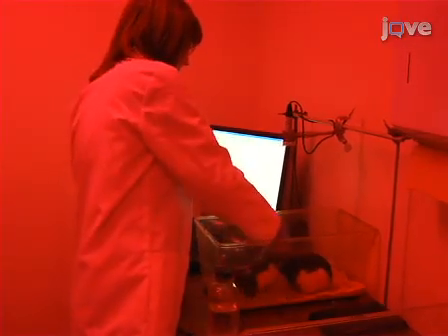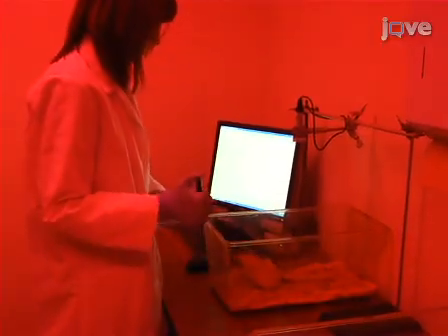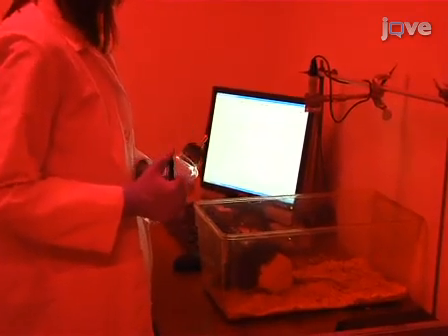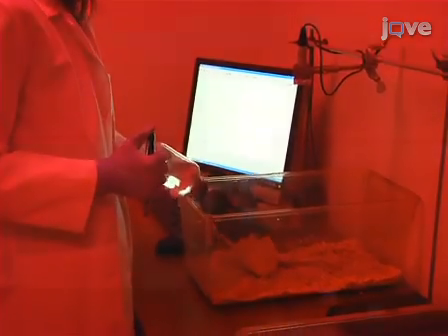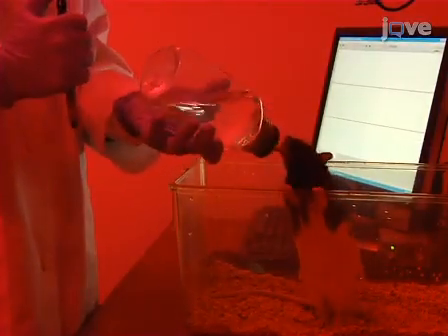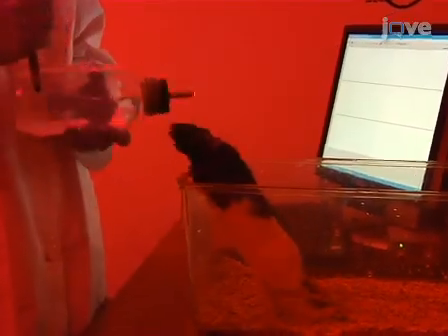Initially, any 50 kHz frequency modulated call is rewarded. Present the reward by simultaneously clicking a pen and briefly presenting a water bottle or food treat. As training progresses, only increasingly complex strings of calls, such as strings of 5 or 10 calls in rapid succession, are reinforced. Continue training until 30 reinforcements have been given. This typically takes 5 to 10 minutes.